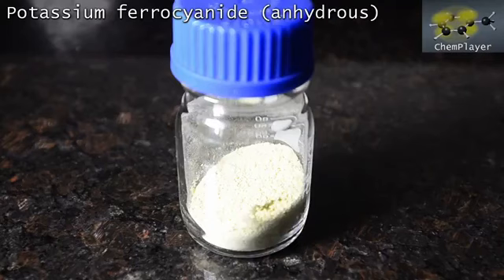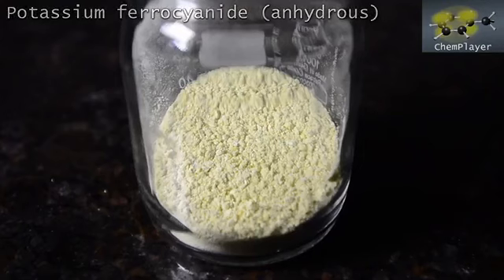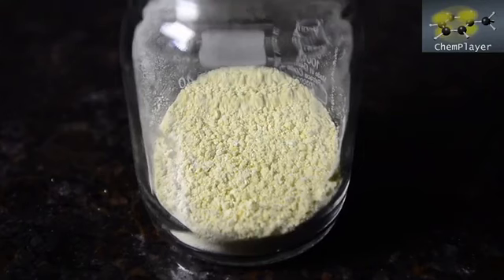So here's the starting material for making cyanide via this method. Anhydrous potassium ferrocyanide. It has to be absolutely water-free and anhydrous because otherwise the water content would react with the sodium and you'll get a product heavily contaminated with sodium hydroxide, which will be useless for most things.